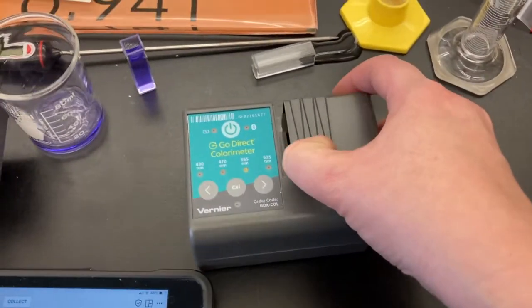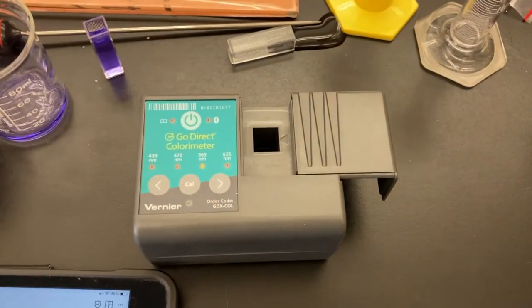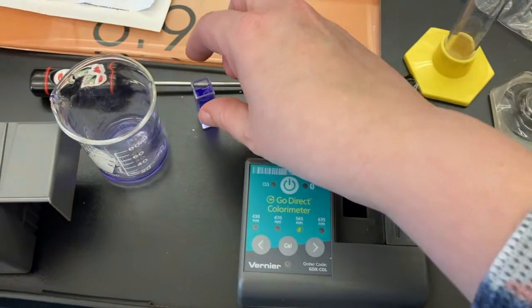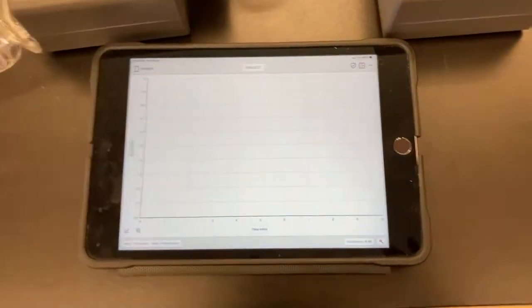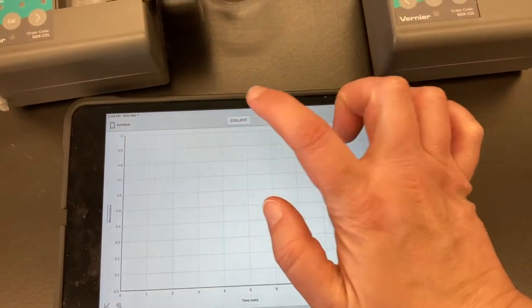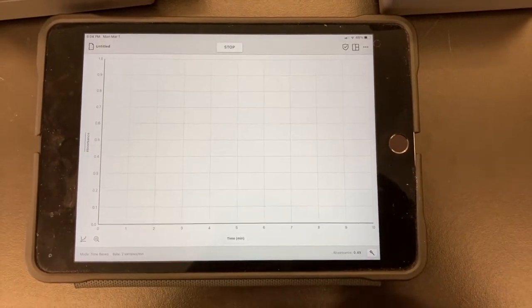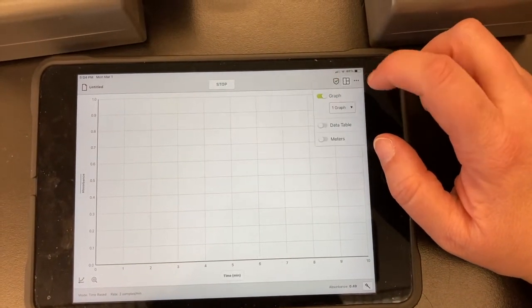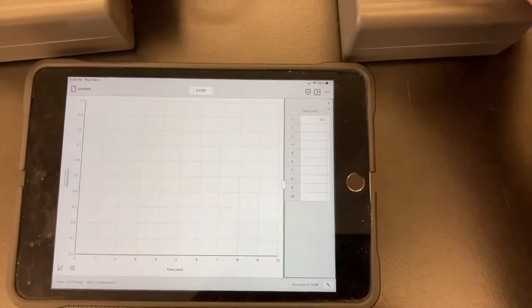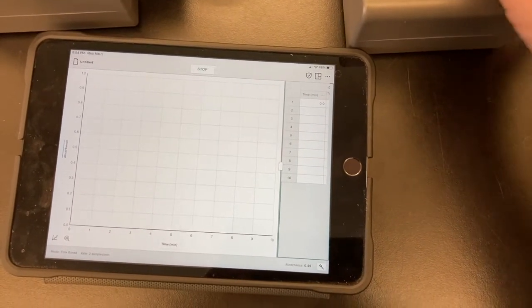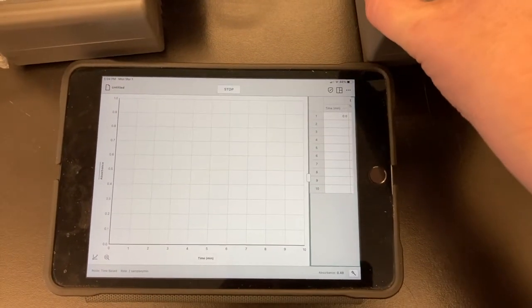Now we want to keep our cuvette from getting warm by what's going on inside the colorimeter. So what we are going to have to do is take it out after each reading. So we can stick it in and then we can start the collection. And we will wait for that first data point to appear and one thing that you can do is you can show the data table and so you will see when that first data point appears.